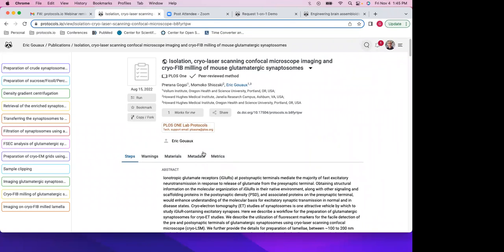So some people, if they cannot reproduce it, they also can click on it. Somehow the new researcher, when they look for the protocol, can have a general view, an estimate of the possibility of reproducing this protocol.